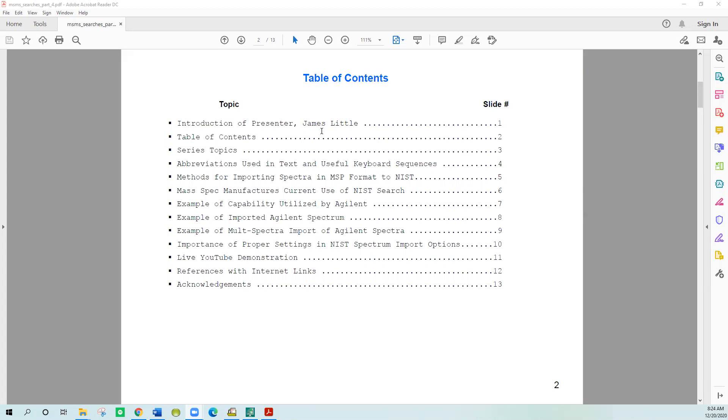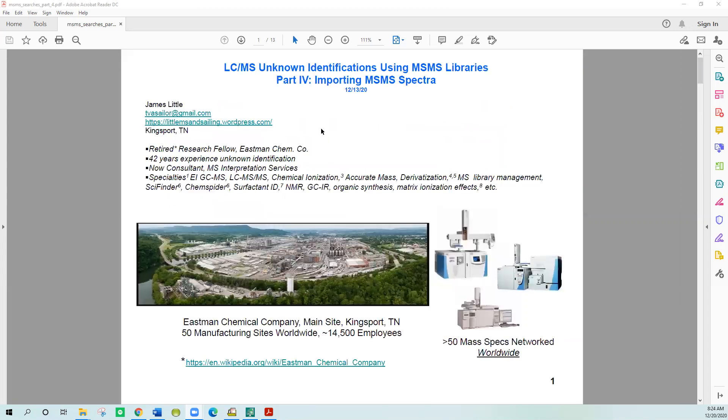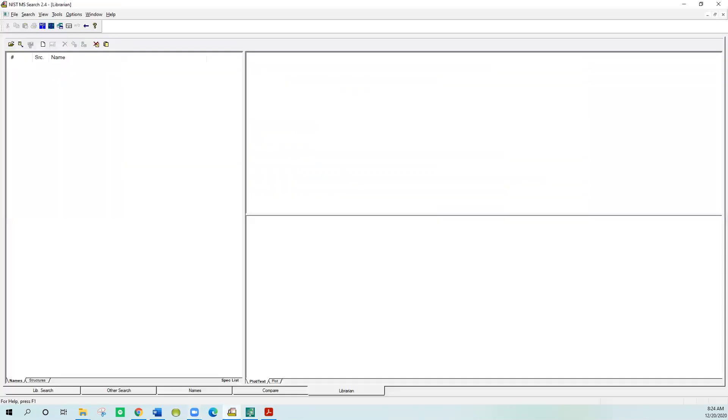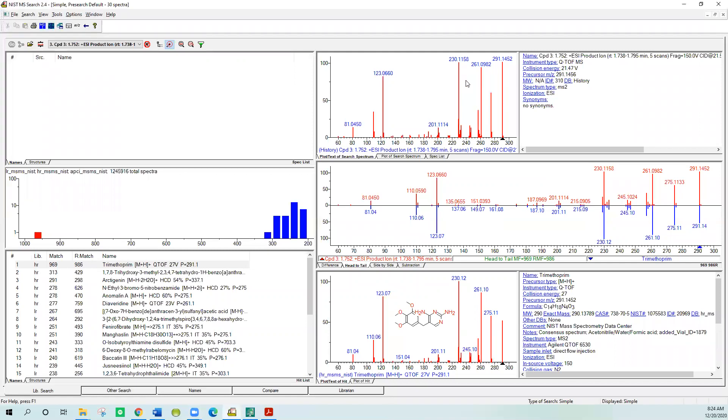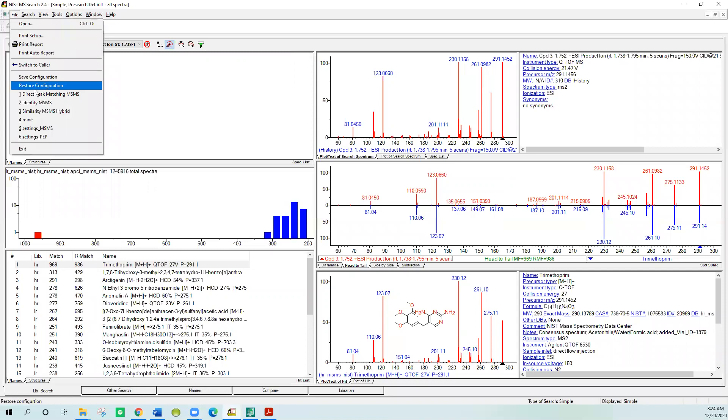Let's get started. Let's start looking at the software. This is the NIST search software. We just need to make sure it's set up properly. Today I'll just be doing a peak matching comparison of things, so you look at the unknown which is up here at the top and you find the best hit in the library, in the NIST libraries.